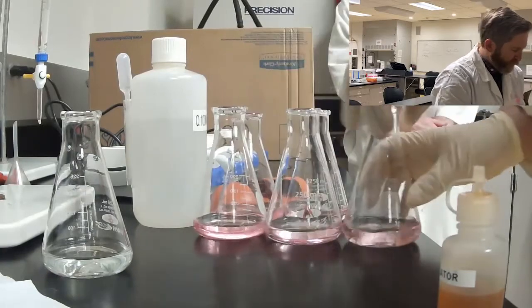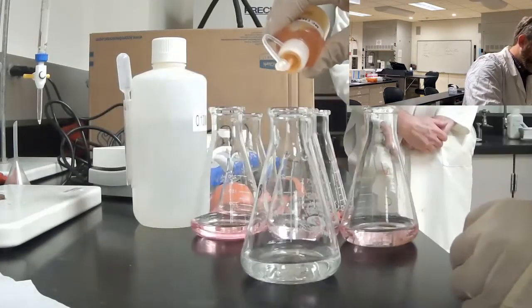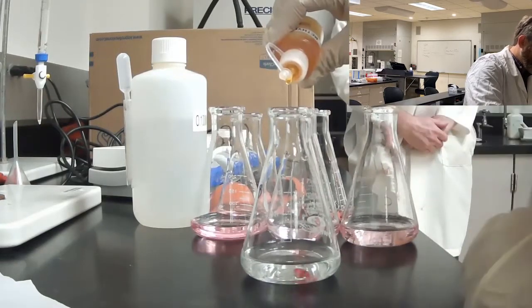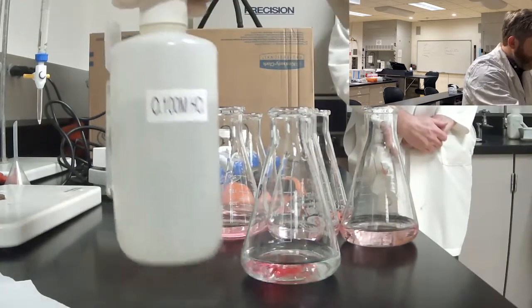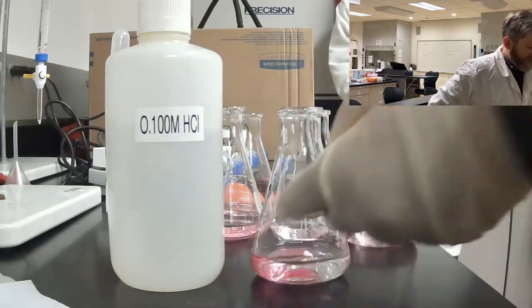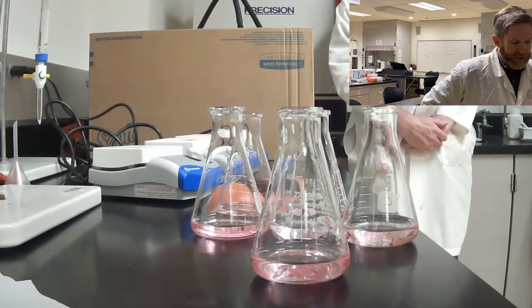I'm just going to add the 4 drops to this one so that you see that that's what I did. And what we have put is 50 mL of our 0.100 molar hydrochloric acid stomach acid, and then we have added the dye that shows the color that we're going to be using to measure our color transition.